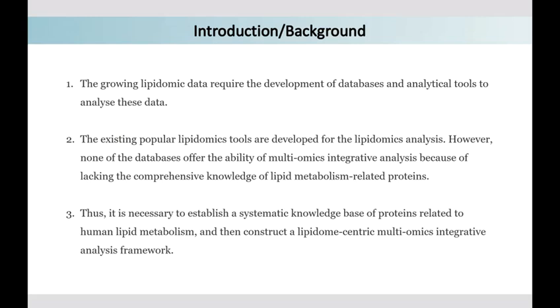With the rapid development of lipidomics, the growing lipidomics data require the development of databases and analytical tools to help researchers work with this data, from lipid identification, pattern recognition, to biological interpretation. The existing popular lipidomics tools are developed for lipidomics analysis.